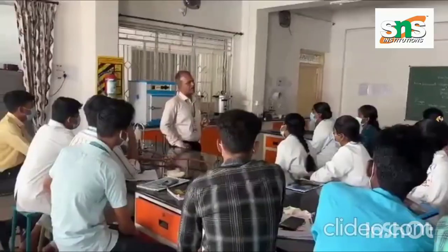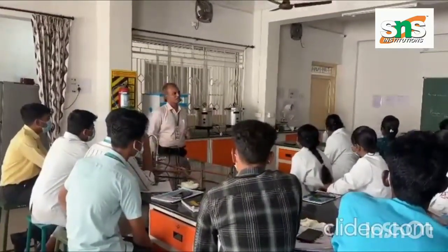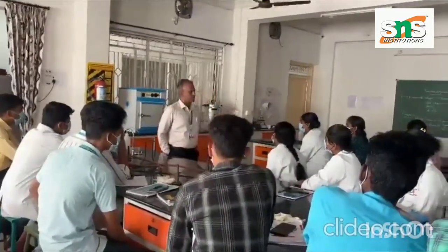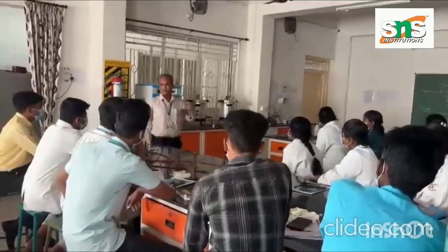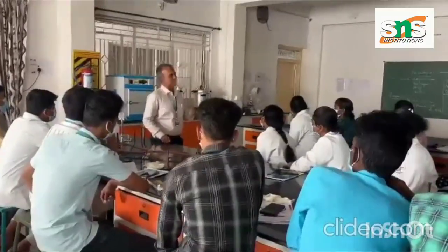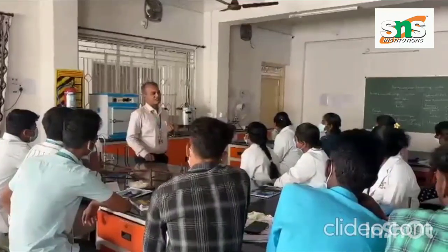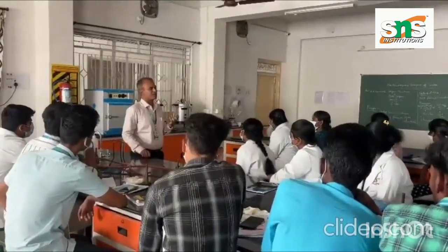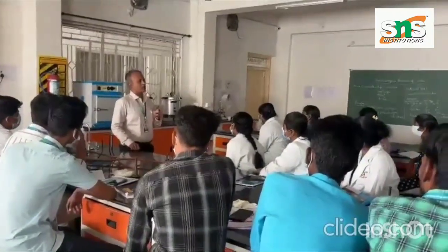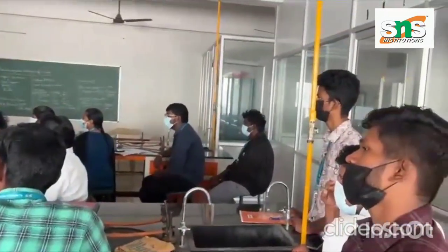The aim of the practical is to enumerate the coliform bacteria. Coliform bacteria are the main pathogens present in water with fecal or other contamination. The coliform bacteria achieve growth inside the water, and inside our body they produce discomfort or allergy in our digestive system. Thereby they might produce diarrhea, dysentery or other life-threatening disease, depending on immunity or vulnerable populations. Vulnerable populations are the geriatric and pediatric.